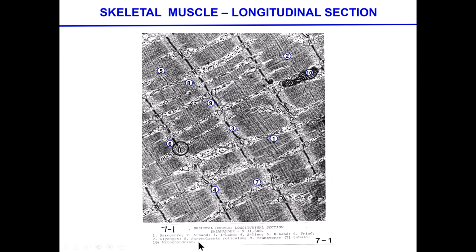The only thing that we haven't mentioned is where some of the accumulation of glycogen can be located, and it's typically located in the surroundings of the sarcoplasmic reticulum, along these potential locations. Everything else, if you look at it by yourselves later, is exactly the same description of things: the Z lines, the I band, the A band, the H band, the M line, and so on and so forth. And I guess you can figure out what number 6 is.